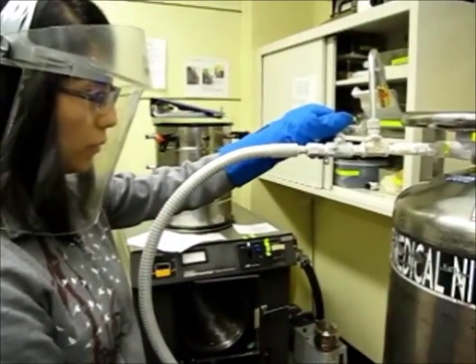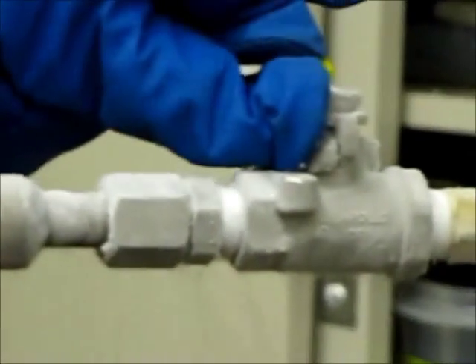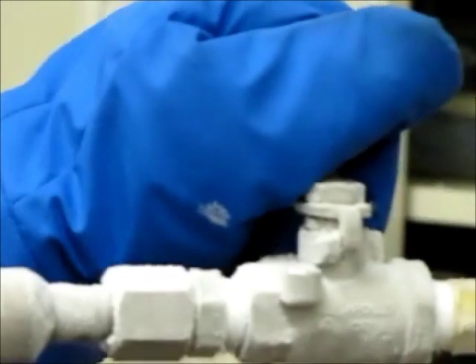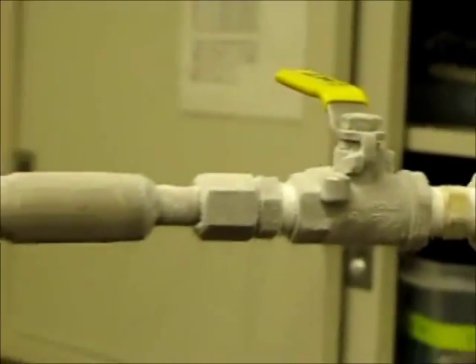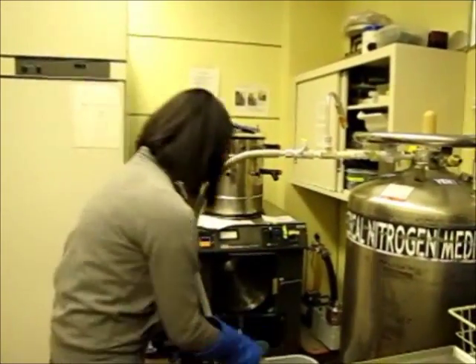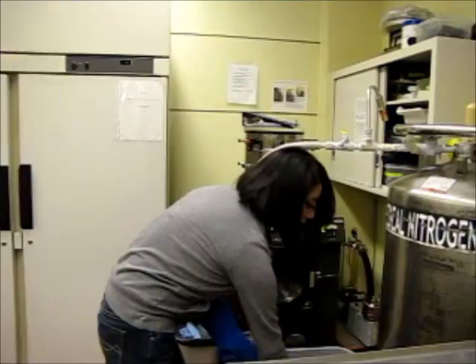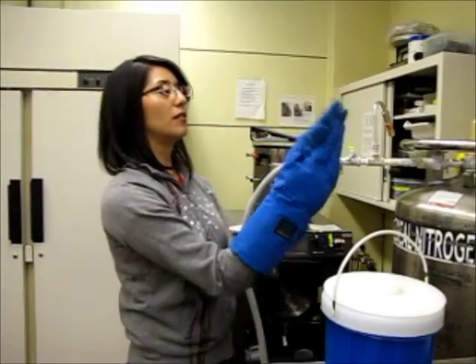When you are finished, close the lever completely. Do not leave it open — make sure it closes all the way. Take off your mask. Make sure to place the cap inside. You take out your container, then take off your gloves, and you are finished.